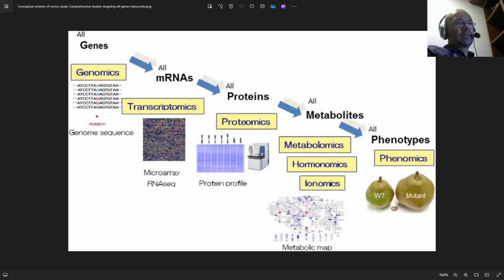First, data collection. Gather relevant data for the samples. Second, data preprocessing. In our case, we will use the R programming language. Third, differential expression analysis. This step helps us identify genes that exhibit significant expression differences between conditions. One example is healthy versus diseased.